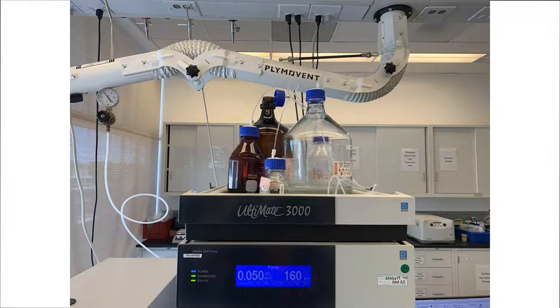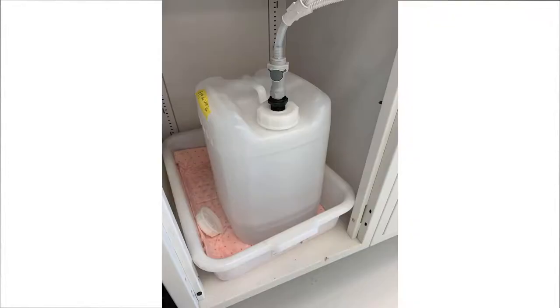Check that there is a sufficient amount of eluent to run all samples. If the eluent has been changed, be sure to purge the system for 3 to 5 minutes. The procedure to purge the system will be highlighted in the pump section of this video. Ensure waste levels are below 3/4 of the waste container so that they will not overflow.